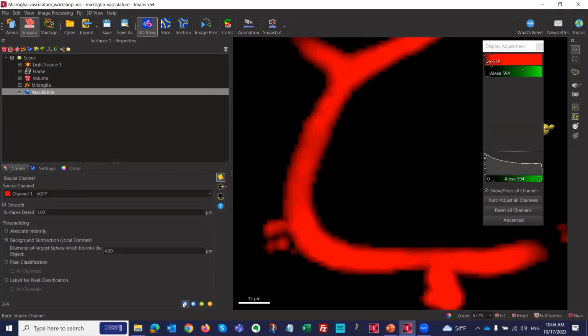So I go back and just give a sneak peek. LabKit pixel classification you have available, and we can discuss this and talk about it in the one-on-one sessions. And this is a very tiny sneak peek: we can use the pixel classification native in IMARIS.